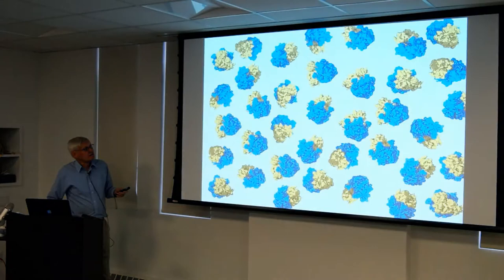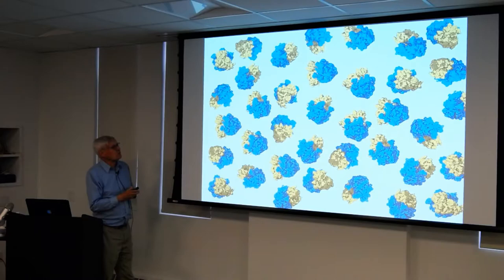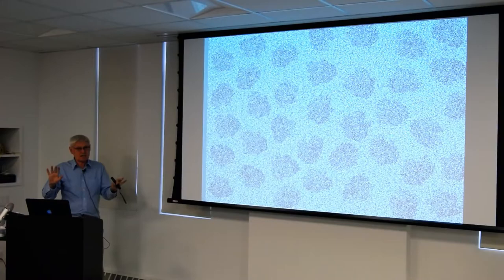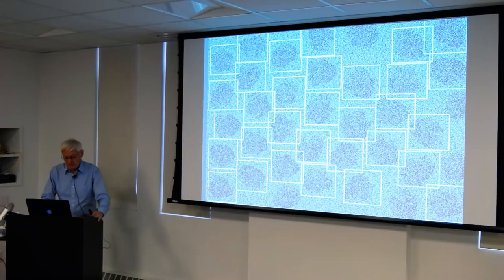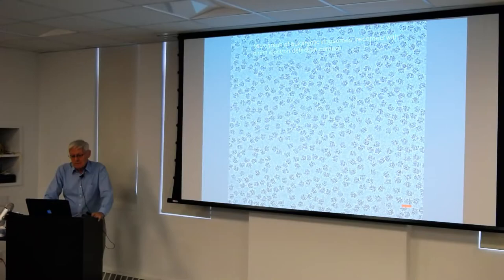And then you have to figure that in the liquid phase, the molecules are doing all kinds of movements, conformational movements, and then you get a frozen state in one single snapshot. And then with a computer, you excise the different particle images, with all kinds of particle picking algorithms, and then in the end you have a gallery with which you now have to proceed to 3D reconstruction.